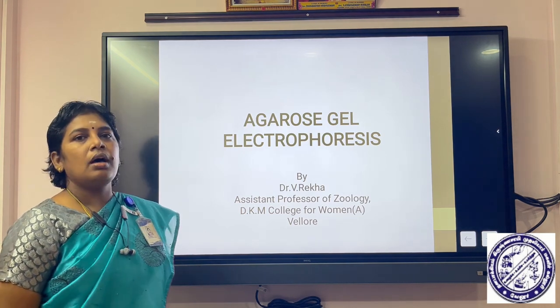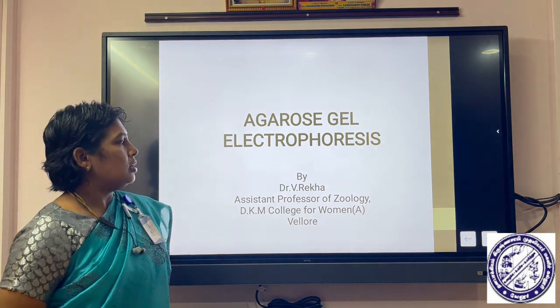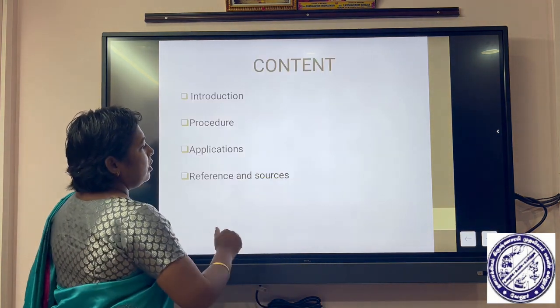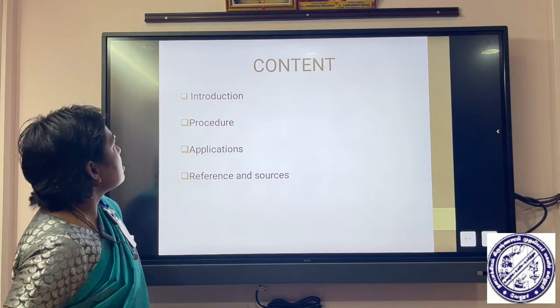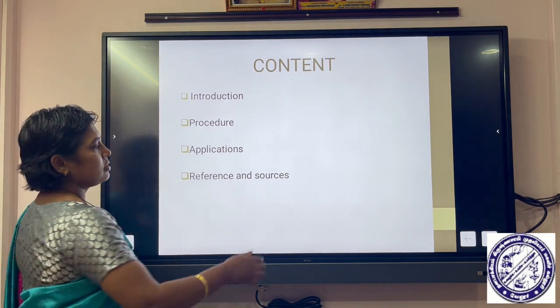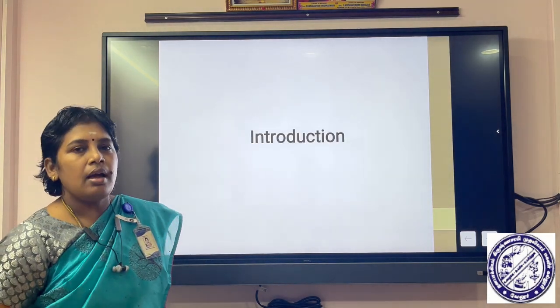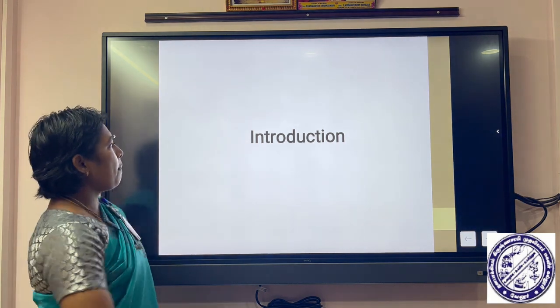Good morning, students. Let me teach about Agarose gel electrophoresis in today's class. Let us see the outline of today's presentation, which includes introduction, procedure, applications, and references. So let me start with a simple term: what is meant by Agarose gel electrophoresis.